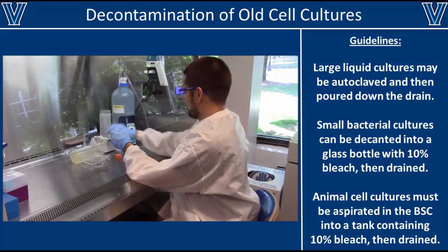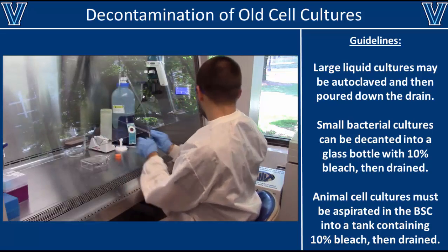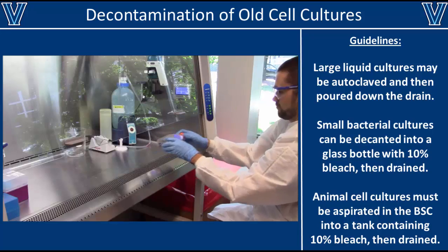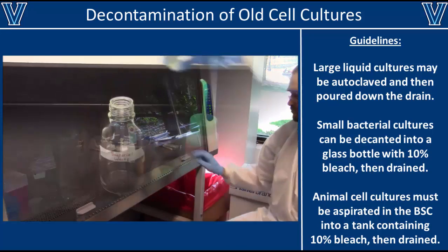However, remember to put 100 to 200 mL of bleach back into the aspirator tank to keep it sterile. And as we already mentioned, dispose of any glass Pasteur pipettes you use in the glass waste box and any dry cell culture materials in the red biohazard bag.